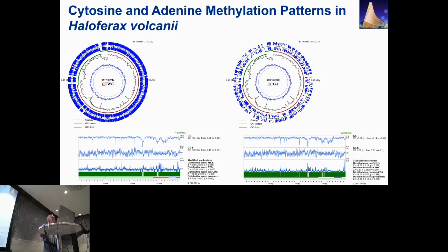If we want to do assembly from metagenomes, this approach can also be used. We very often create hybrid assemblies. And because methylation patterns are very specific for individual clonal lines, for individual strains, we can distinguish between contigs generated from one sequence and another sequence, even if they belong to similar organisms.